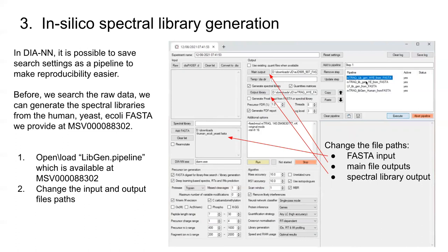If that's what you wish to do, what you should do next is change some of these file paths — specifically the main output and the output library — and then add in the FASTA that you downloaded from MassIVE, or maybe you have your own FASTA that you would like to in silico digest and predict the library from.